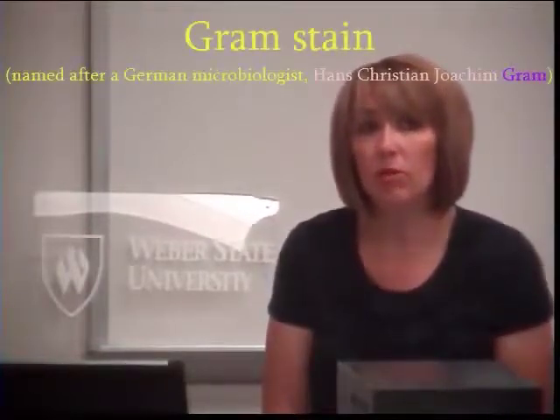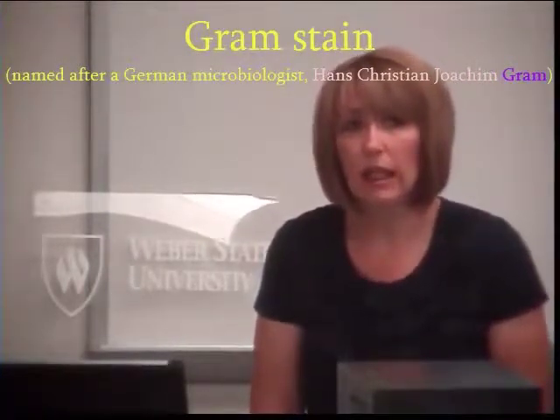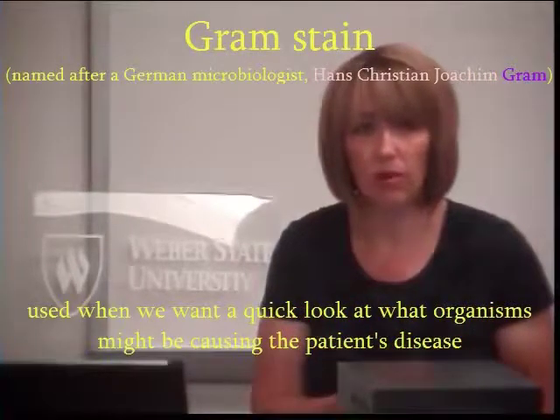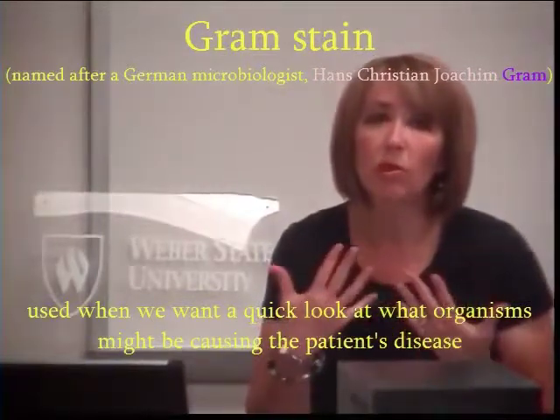So we're going to go now to objective three and talk about how we stain these. I just showed you some Gram stains when you saw the purple and pink ones that were not electron microscopy. Those were Gram stains, and that's the classic stain that we would do if we wanted to give the physician a quick look right off about what organisms were there. Now, we only Gram stain certain types of cultures. In your throat, you have so many organisms that live there normally, it would be silly to Gram stain it because we'd see a whole bunch of stuff and who would know if it should be there or not. But in things like a wound or things that we would expect to be sterile, a Gram stain can be very useful. I'm going to explain this procedure to you and then we'll look at the slide.